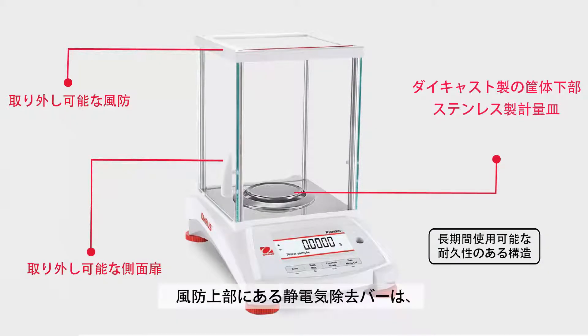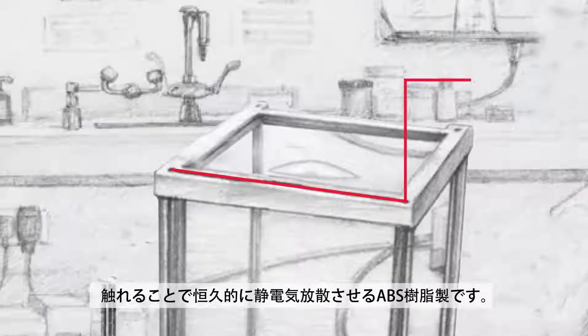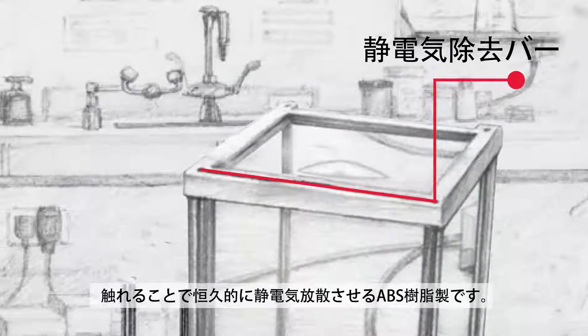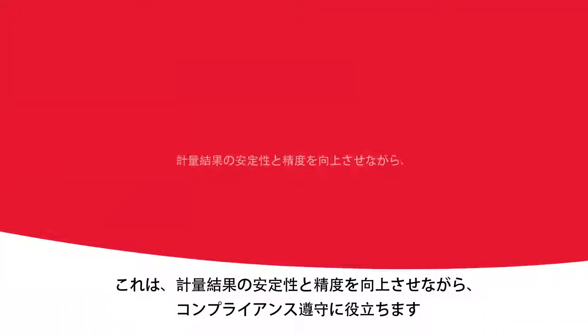A static removal bar along the top of the draft shield provides a convenient grounding location, allowing the user to discharge any static charge that may have accumulated prior to handling samples and weighing. This helps compliance with good weighing practices while improving the stability and accuracy of results.